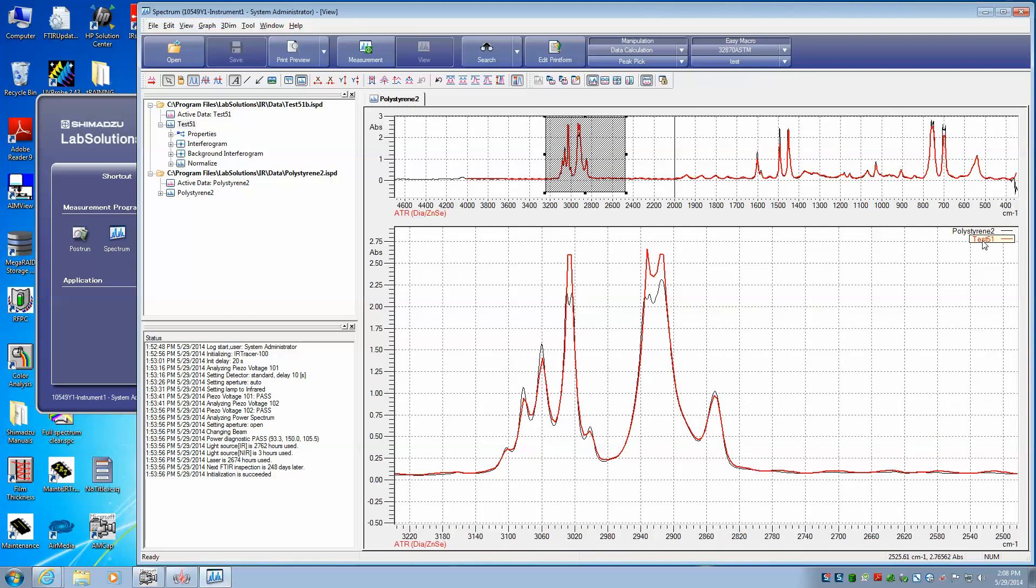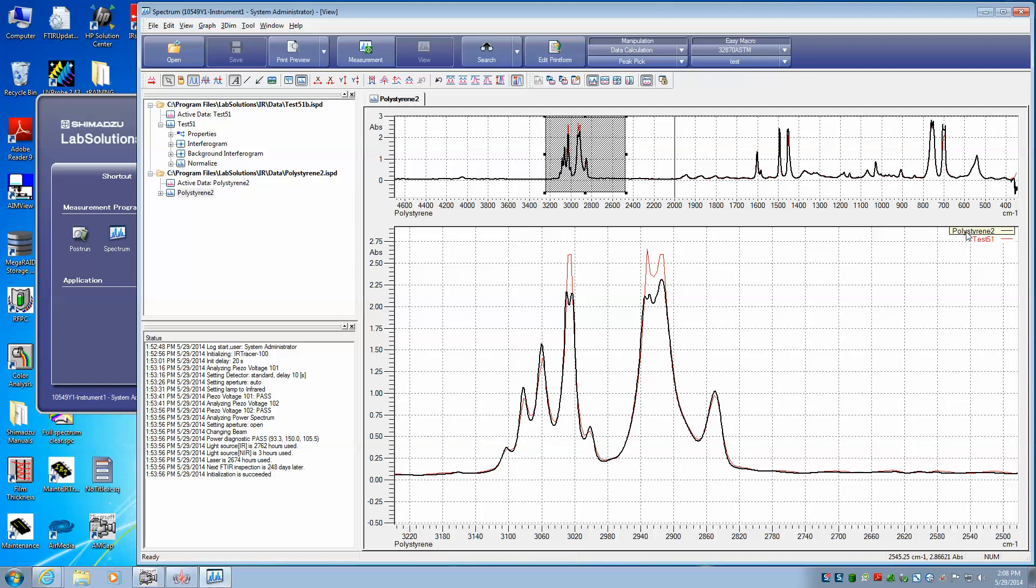and the one that's highlighted has the darker line. So right now the test 51 is the selected file, and over here you can see that it's lightly grayed out. If I go back over and click on the polystyrene, the black then becomes a heavier line, and you can see that the gray is switched from the test 51 over here to the polystyrene 2.